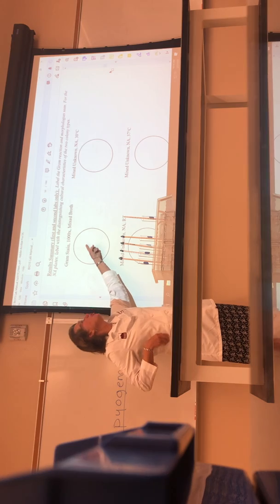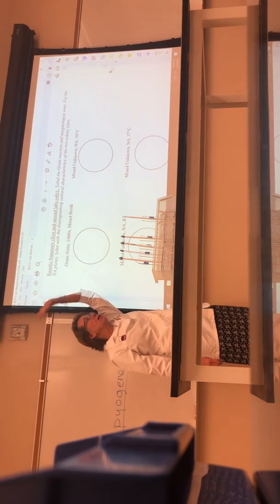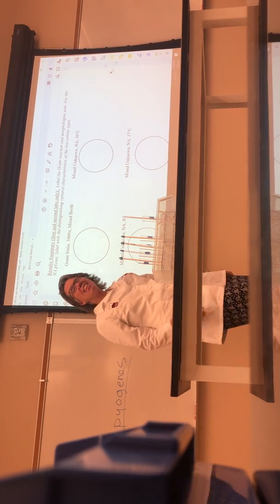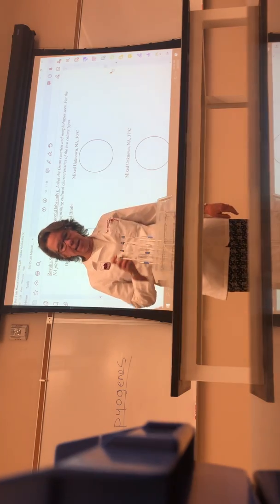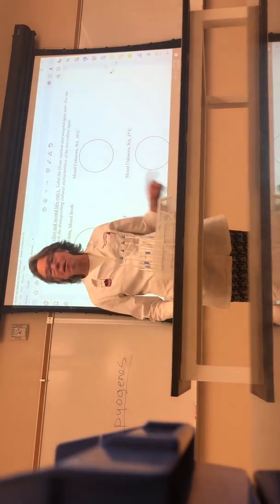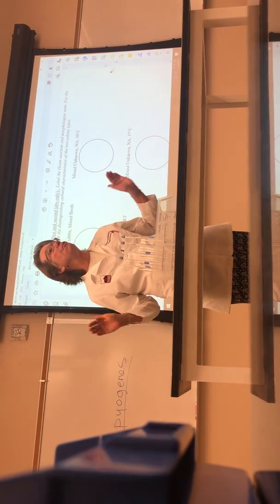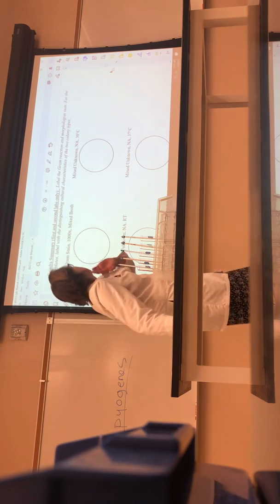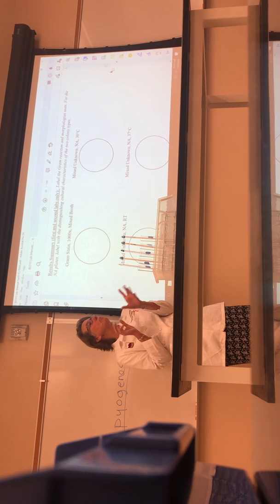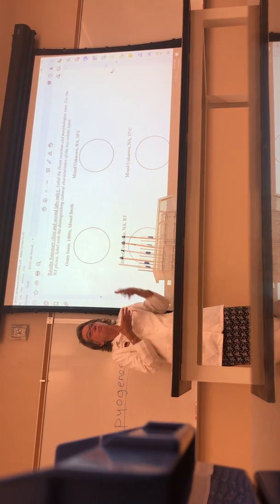Do you have 2 bacteria in there? Who has 2 bacteria in their gram stain? Mixed gram stain should have had 2 bacteria. And I think I told you the next day, hint, hint, wink, wink, you should have had a gram positive and a gram negative. Now, you might not have seen that the first day, and that's okay. But you should have something drawn in there, okay? When I was grading notebooks, I didn't really grade that, but I did notice maybe half of you hadn't even written that in there.